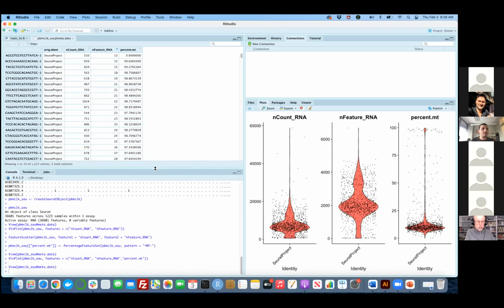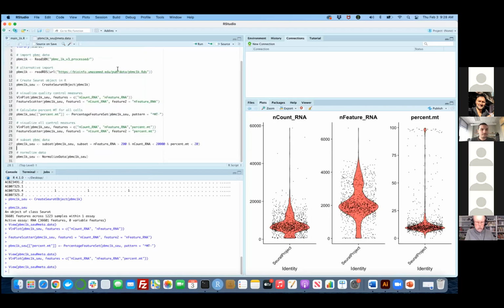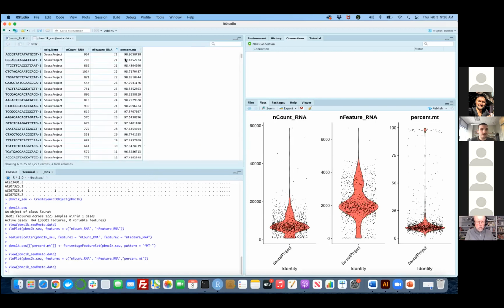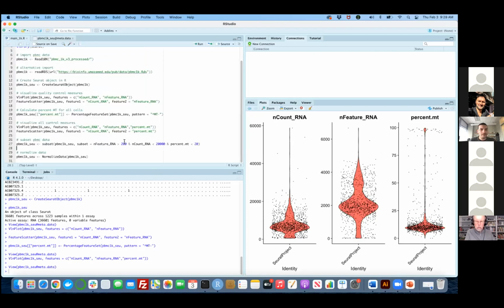We will see how we cluster single cell data sets, but this may indicate that these cells are not really important. So in this case, we are going to remove all the cells whose nFeature_RNA, the non-zero gene count, is lower than 200, by selecting those that are higher than 200. Basically, we are just taking a subset.